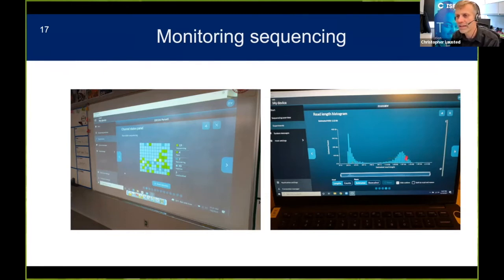You want the full-length DNA so that you can most accurately identify the microbial species, but even this fragmented DNA, and some of the samples were pretty fragmented, even that is interpretable. The beauty of sequencing is that you can get information from most anything.